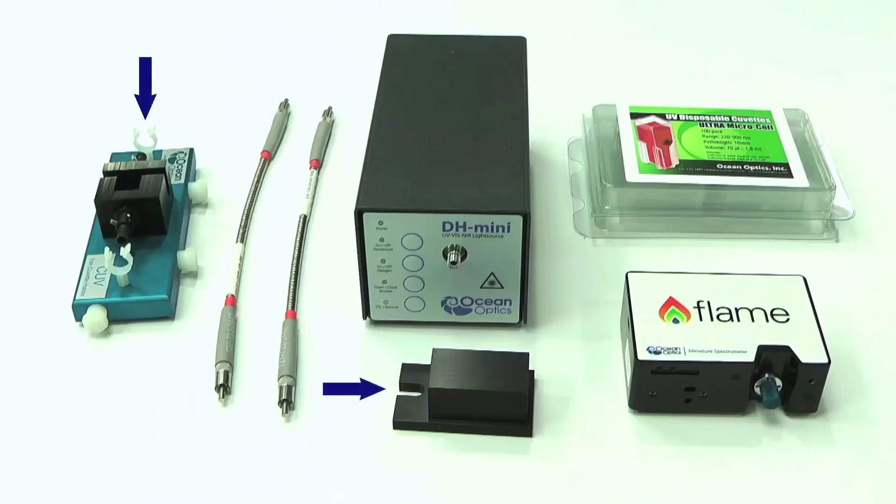The CUV cuvette holder along with its cover, which prevents external light getting in, and a pack of 8 UV plastic cuvettes for use in the wavelength range of 220 to 900 nm.